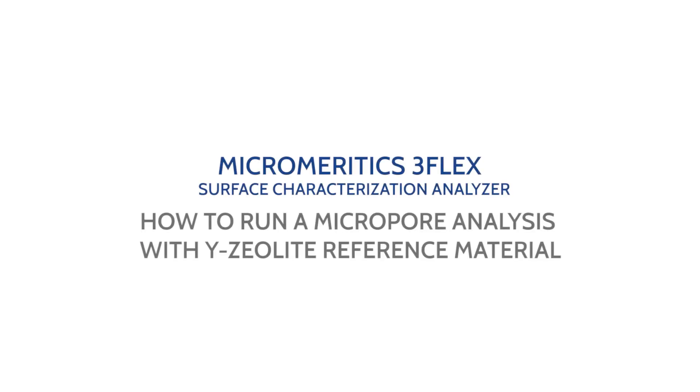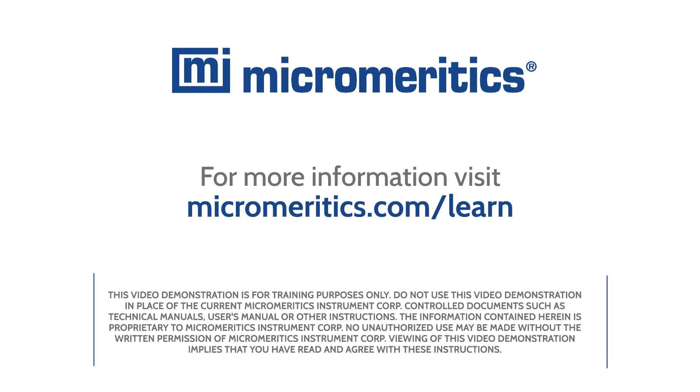Now you're ready to analyze Y-zeolite reference material for micropore analysis on the Micromeridics 3-flex surface characterization analyzer. For more information, visit micromeridics.com slash learn.